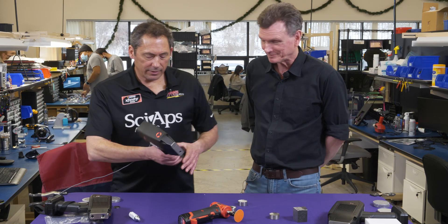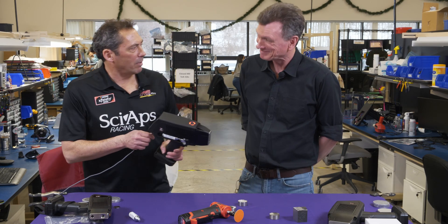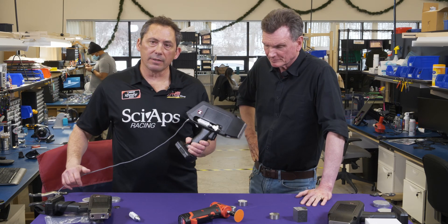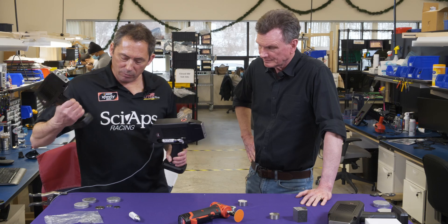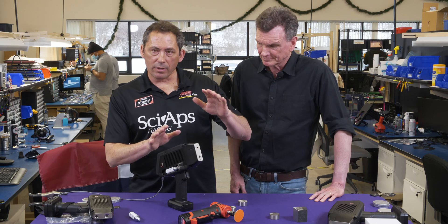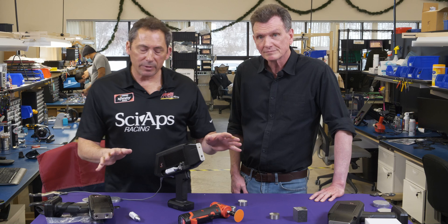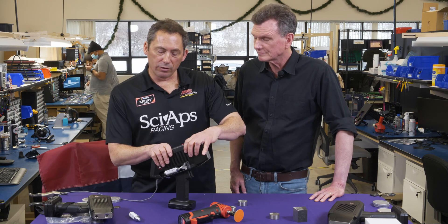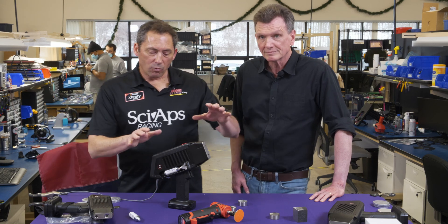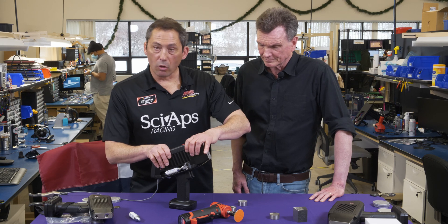This unit weighs about three and a half pounds — about the same weight as some other XRF units; this XRF is only about 2.7–2.8 pounds. To recap: we certainly make a full unit with all the alloy bases plus carbon, but now we also have a carbon-only unit. So if you love XRF and want to use it for all your other metals, you use XRF for metals and this unit for carbon and silicon.